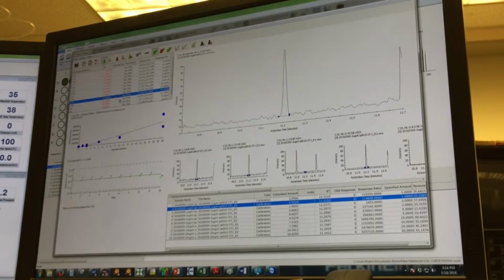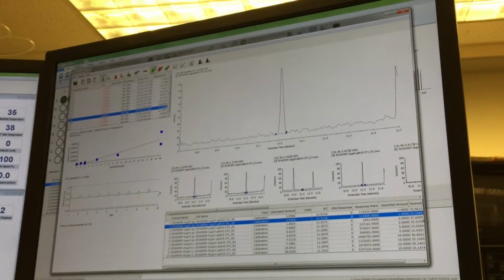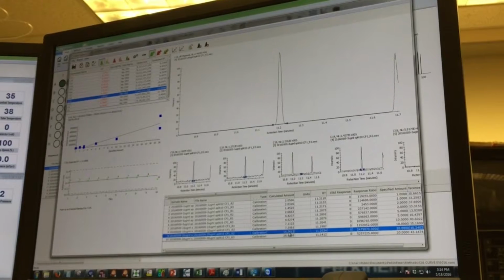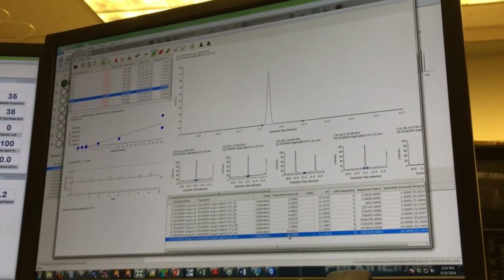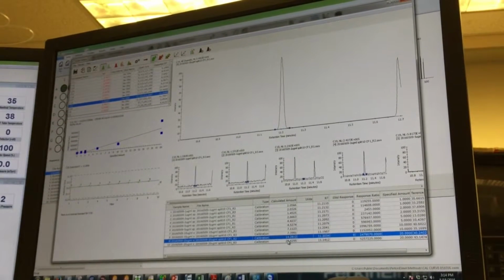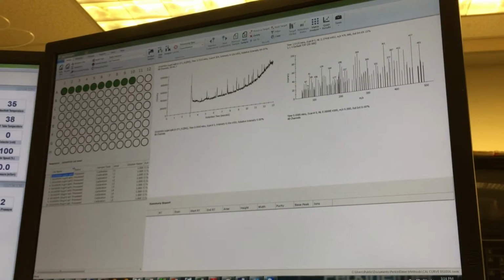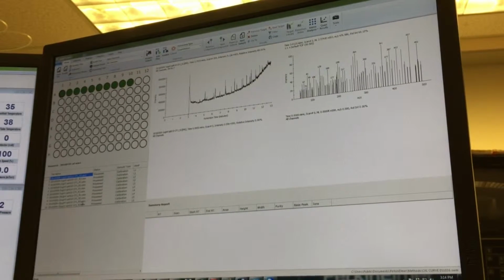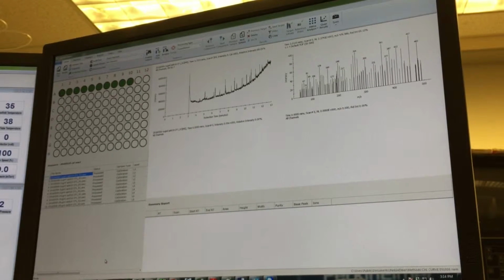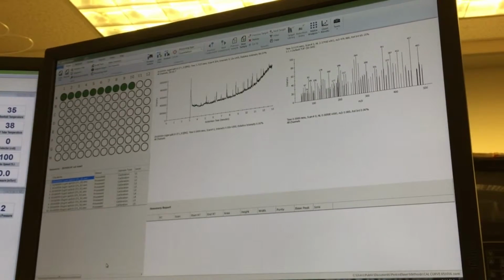10.2, it chose, you see the retention time, here one is 9 and one is 10. This way it gave this result. It chose the wrong file. So it's better to choose, because in my case what I did, I thought I would do a shortcut, because for 1 I have 5 replicates, for 2 I have 3 replicates, for each of them I have at least 3 and 5 replicates.